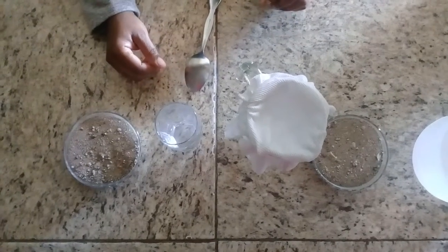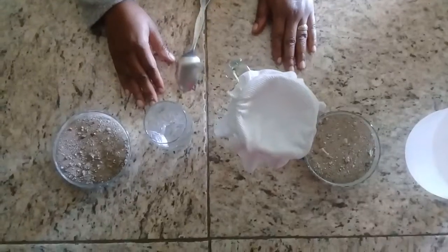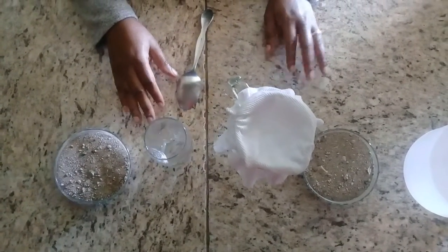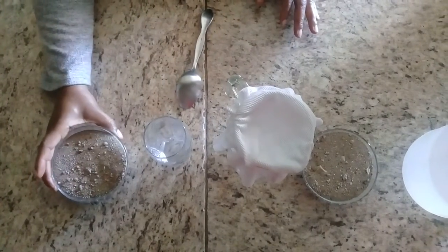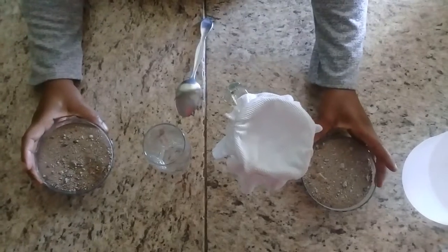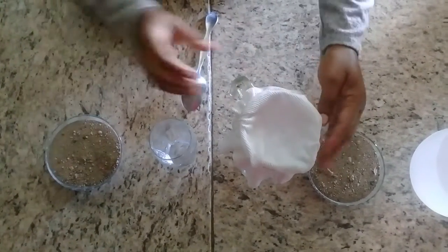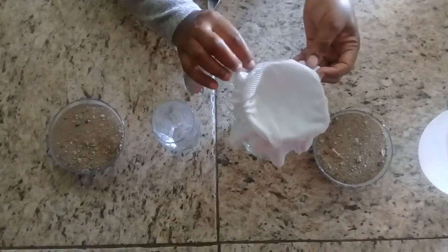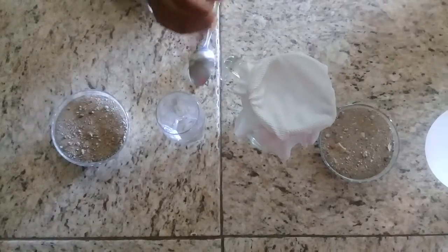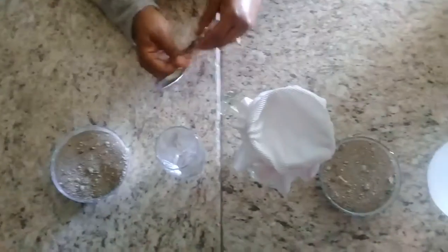I will be demonstrating to you two methods in which we can separate an insoluble solid from a liquid. The insoluble solid that I'm using this morning is sand. So I have two containers of sand. I'm trying to improvise. I have a jar here with a piece of marina cloth that I have used an elastic band to tighten around it. I have a jug of water, and I have a glass right here and a spoon.